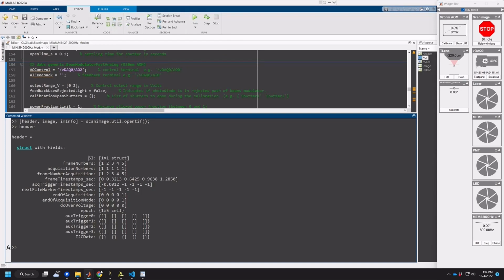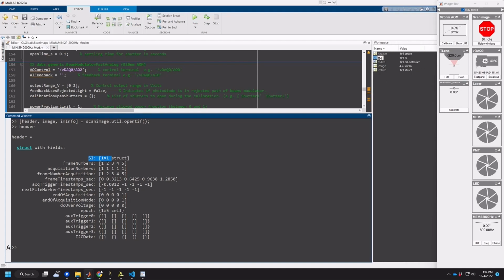you'll see that the ScanImage object, which is the same as this handle to the SI object, maybe with a few objects taken out for space, contains all of the configuration that you had done for this particular acquisition, and everything inside of this object, which should be helpful to backtrack what you had done for any particular acquisition that you had acquired with ScanImage. And then also some other information.